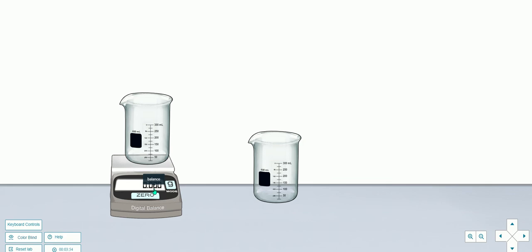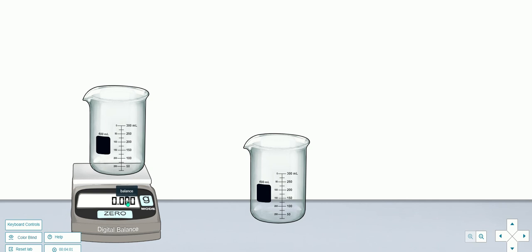So always notice the maximum amount of sig figs that you can record. For something like this, it's easy because it tells you the decimal places right there, and then you just record all of them and that's it. Make sure to record everything.